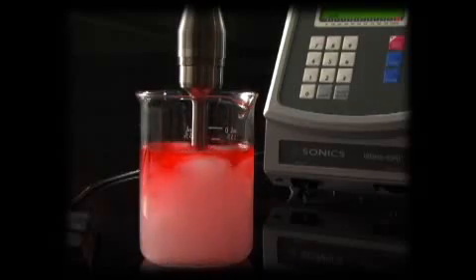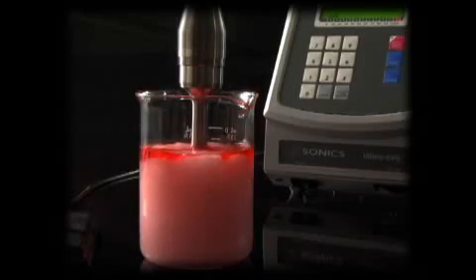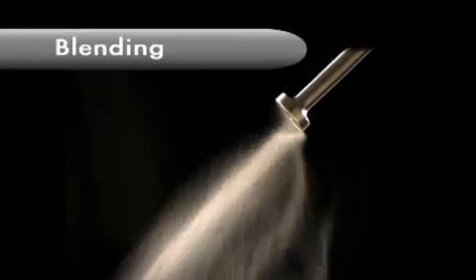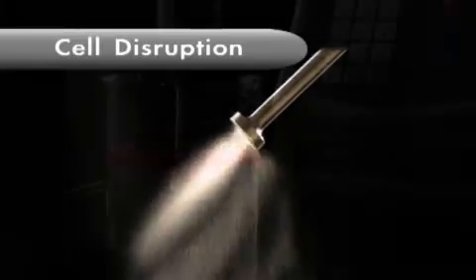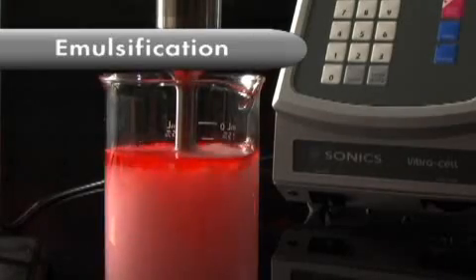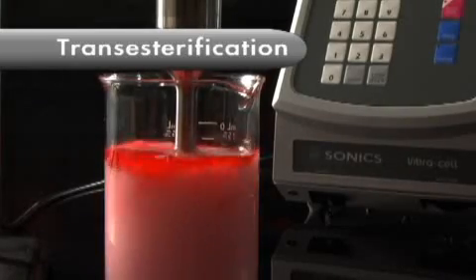Sonics is the world leader in ultrasonic liquid processing and manufactures the most technologically advanced line of equipment in the industry for dispersing, blending, cleaning, cell disruption, sample prep, homogenization, emulsification, transesterification, and atomization.